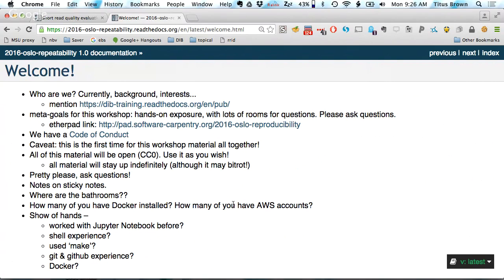We're not going to talk about any of those applications specifically today. We'll actually be doing de novo transcriptome assembly on Wednesday for people that are interested in building their own transcriptome from scratch and thinking about what to do with that. Today is just going to be about trimming and quality evaluation of your data. This is the first time I've really done a full 3-hour workshop devoted to quality trimming. So I put together a bunch of materials. I'm running this in parts so that I can update the materials with the flaws that I discover in them by giving the workshop. It's an applied approach to teaching.